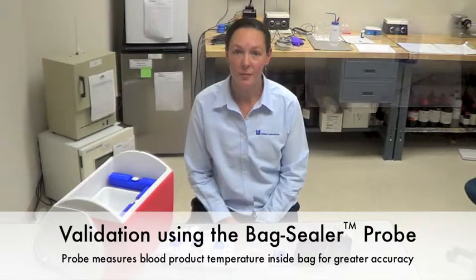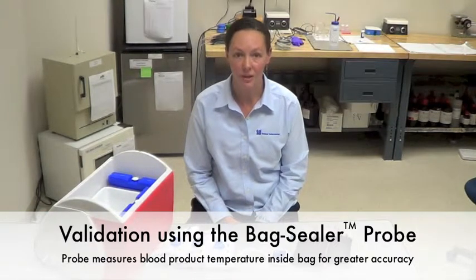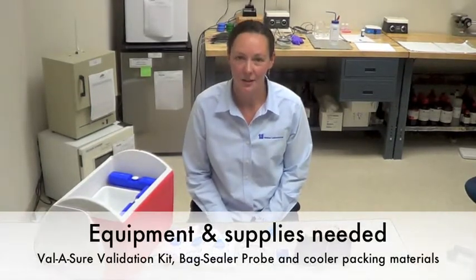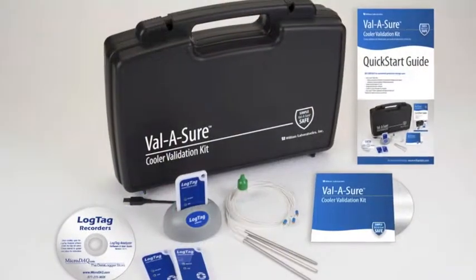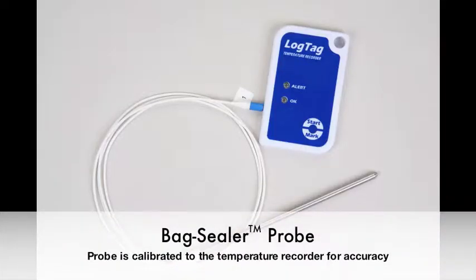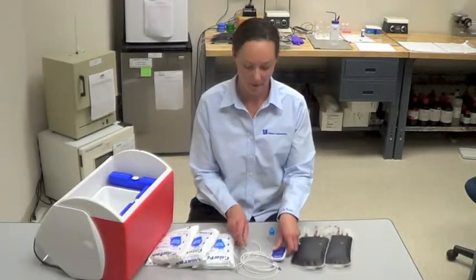I'm going to be reviewing the validation procedure using the bag sealer probe included in your Valishore validation kit. The equipment and supplies needed for this validation include contents from the Valishore validation kit, including the bag sealer probe, which is calibrated to the temperature recorder, and glycerol lubricant.